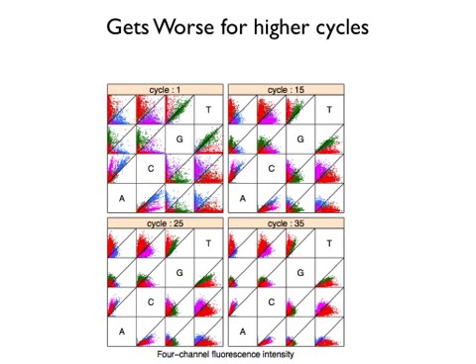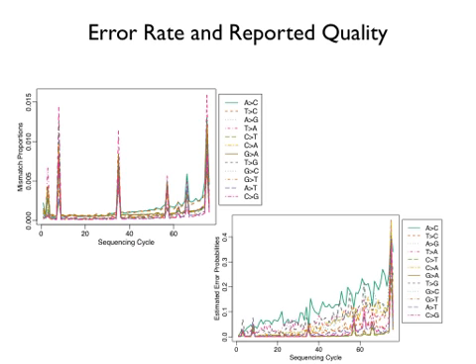That is actually coming from 2 things that are happening. One of them is that each fragment has a fragment effect. Each little fragment forms a cluster and has a different effect. Now within the same cluster, how do we see these big differences? I just think there is still a lot of variability within a cluster. Okay, this is a plot that we still make today. I highly recommend making this plot for any data set.